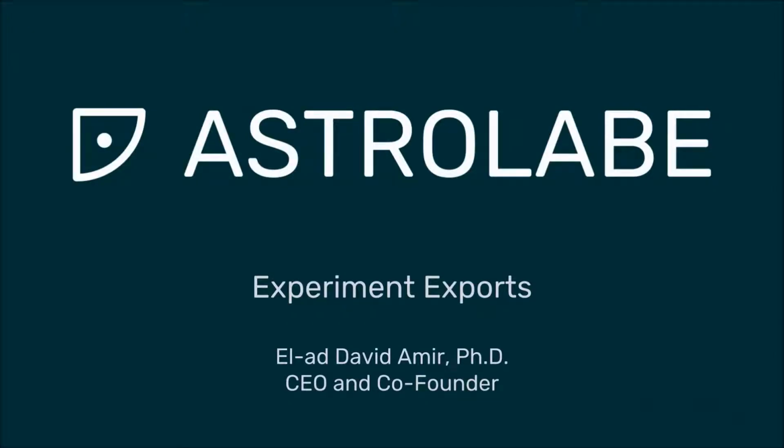Welcome to the final tutorial in the Astrolabe mass cytometry platform series. Here, I will give you a brief survey of the various experiment exports that are available through the platform. The exports allow you to easily get analysis results out of the app and interact with them locally on your computer using any other piece of software.